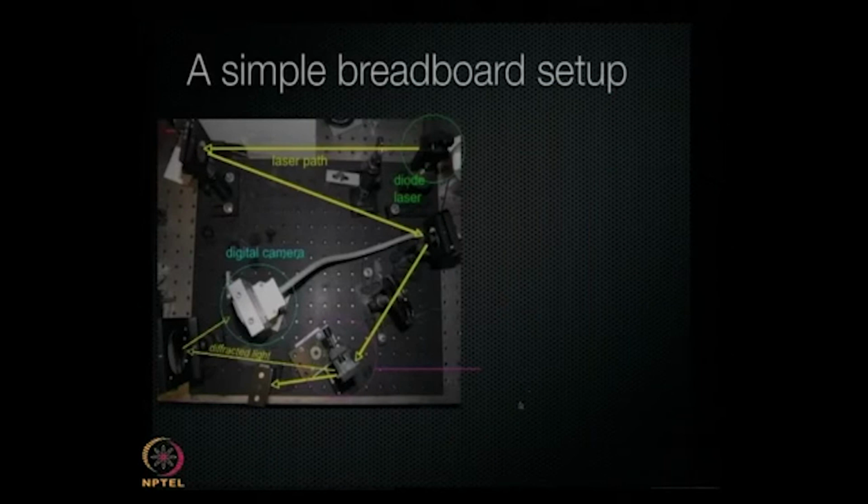And here's an implementation of how simple it can be in our lab. Really, it has three components. The light source, which is, in this case, a laser pointer. It's a 3 milliwatt red laser. And the detector here is a CMOS detector, but it could be a webcam. It could be what's called a photodiode, which is a very inexpensive piece. And here is the sample cell, and let me enhance that.